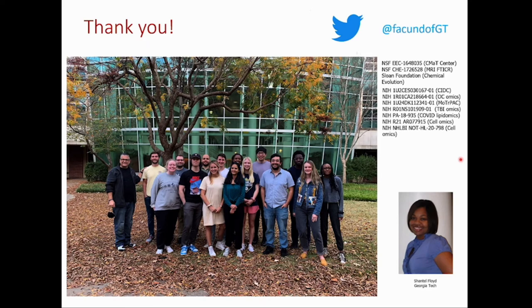Yeah, we've analyzed all sorts of crazy samples. We've looked at breath, cells, urine, tears. Probably the craziest sample that we ever analyzed was blood from a whale shark. That was very weird. They all require a slightly different sample preparation protocol. One that is pretty challenging is adipose tissue, because homogenizing, pulverizing and extracting adipose tissue can be challenging, but it's doable.